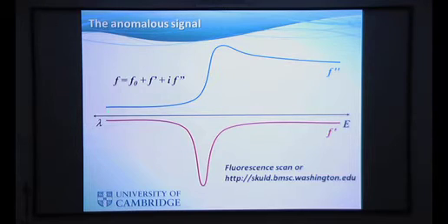This is F double prime. It is at the same level, then rises to a peak, drops off a little, and goes on a higher level, coming down eventually again. F prime has a drop. So if we can measure at a wavelength around here, we can possibly maximize the effect.